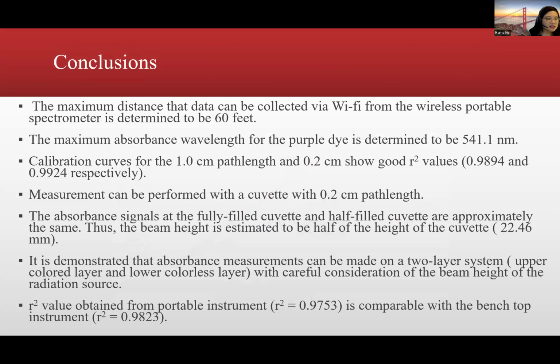Here are the conclusions of what we are talking about. The only new point here is that we tested how far the wireless portable spectrometer can connect to the device, like either your phone or the computer, and the maximum is 60 feet.